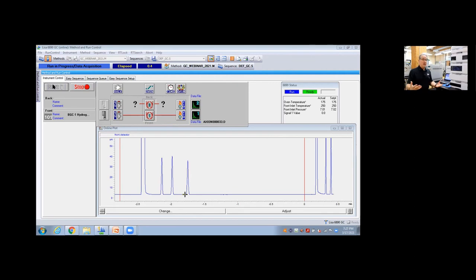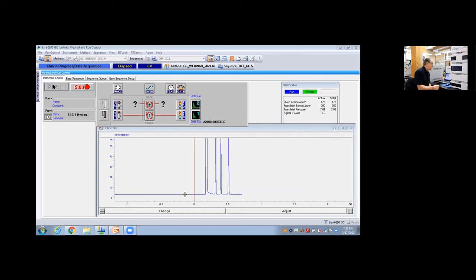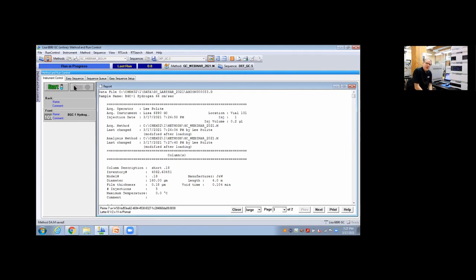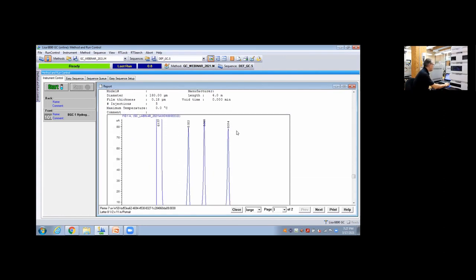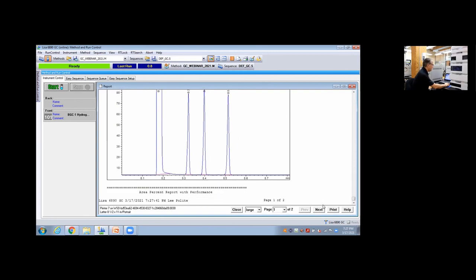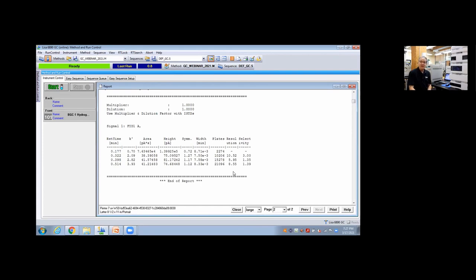Our initial peak should be coming off a lot faster than it was before. And then all of our other peaks should be coming off in half the time. So my one minute analysis could be done in 30 seconds. Could it be done faster? I don't know. You guys tell me, what would you do to make it faster? Oh yeah. So you could increase the linear velocity yet again. Why stop at 64? We could go up from there. So here we're getting our three beautiful peaks, better sensitivity, that has to do with the split ratio, higher column flow, but beautiful peaks. And now our separation is done in, like I said, in half a minute. So let me go ahead and stop it. Remember before we had our three peaks off in a minute, we had a resolution of somewhere around eight, 7.76 on the helium and somewhere a little over eight for hydrogen. So now we are operating twice as fast, half the time. And our resolution is 8.55. What? It went up. So we're loving that Van Deemter curve. It gives us faster analyses that are still good. No loss of quality. In fact, a slight improvement in the quality.